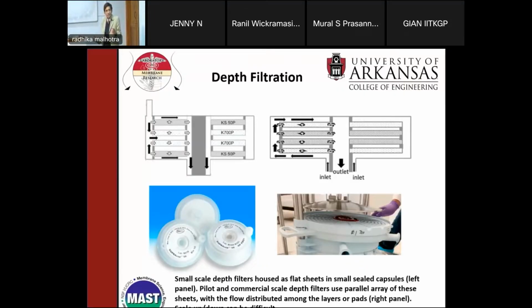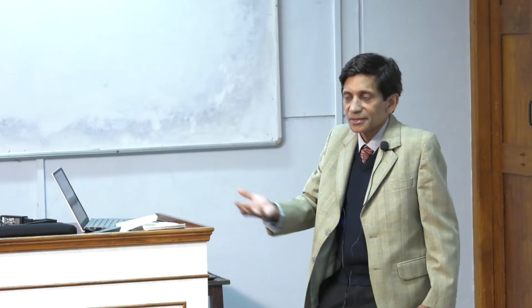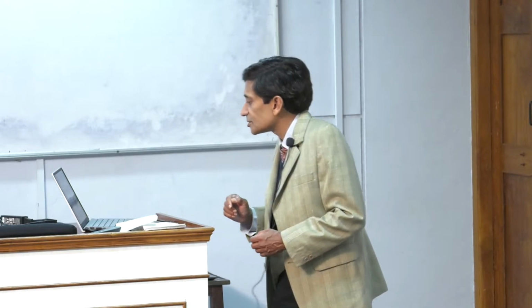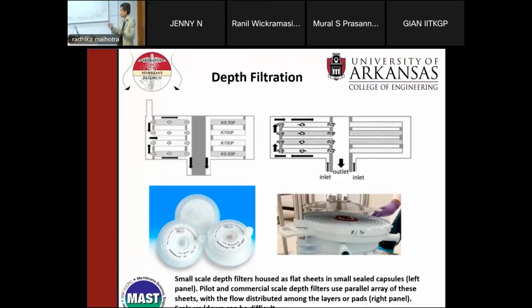So that's great, but you need to have good flow distribution, because if you don't have equal flow distribution between these, then you're having inefficient usage, and you might be overloading one compared to the other. So one can plug and block, and then the whole thing fails. So one of the complications is that you need to be able to have good flow distribution between these parallel paths, right? And this means sometimes scale up and scale down can be difficult. Okay?